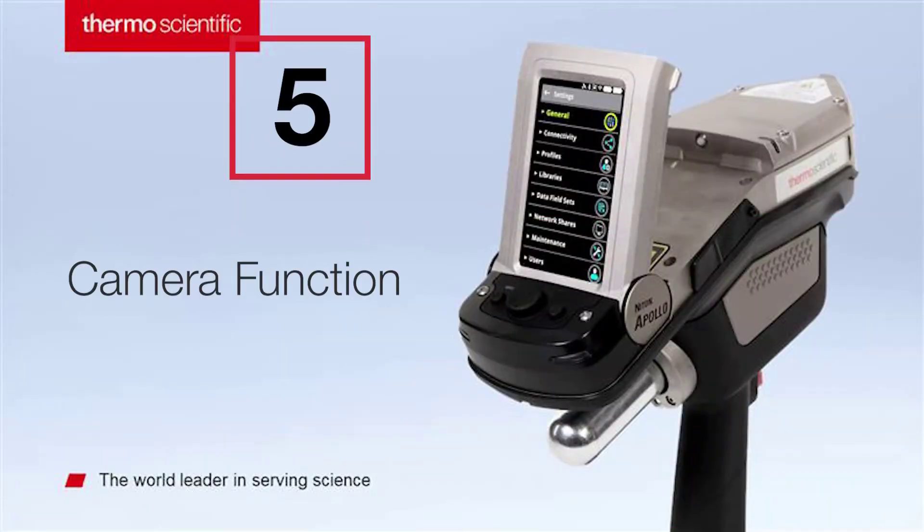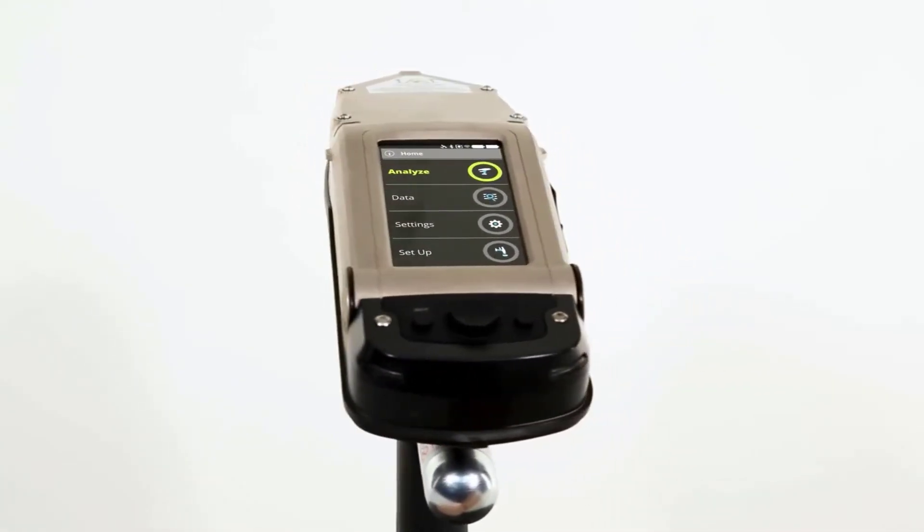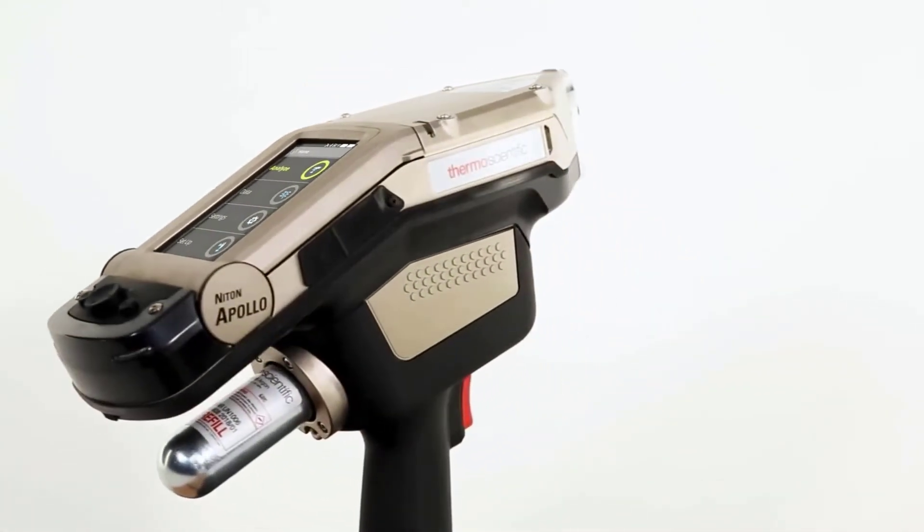Keep track of your sample records. Equipped with micro and macro cameras, the Niton Apollo will pinpoint your exact measurement and collect sample imagery.